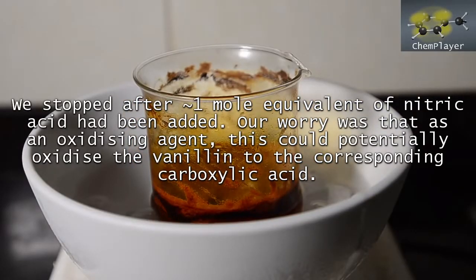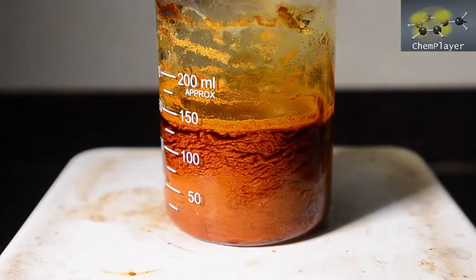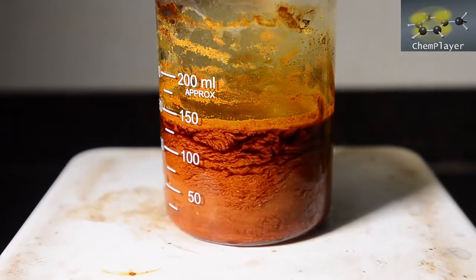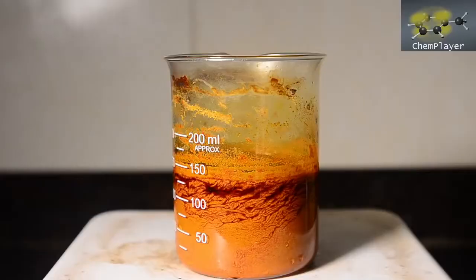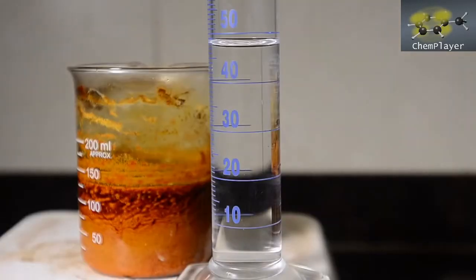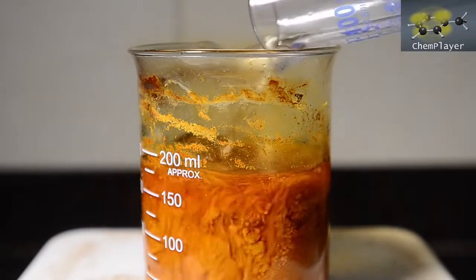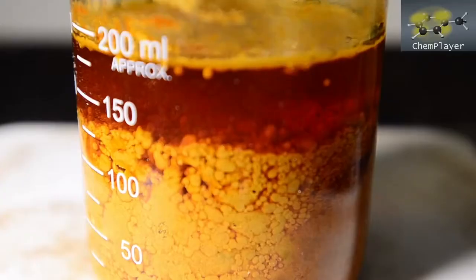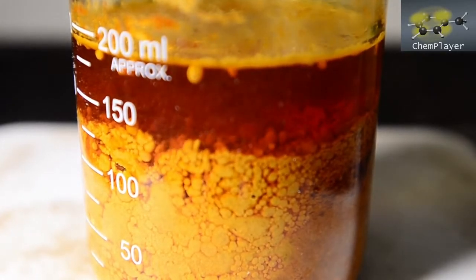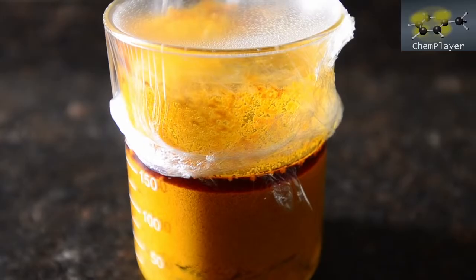So we left the mixture stirring in the ice water for another 30 minutes. And then allowed it to warm slowly to room temperature with stirring over another 20 minutes. Next we measured out 45 ml of water, and added this to the mixture. And then we chilled down in the fridge for a couple of hours. It's certainly a very pretty reaction mixture.